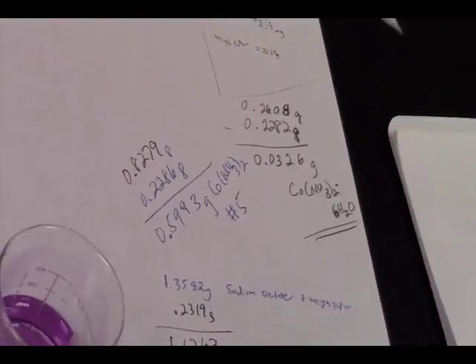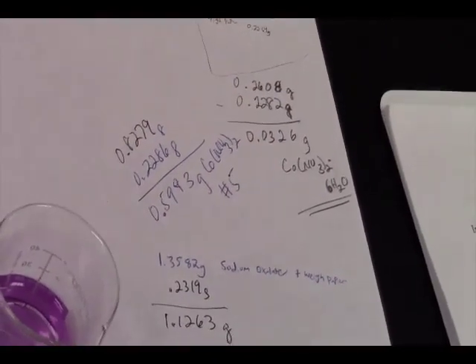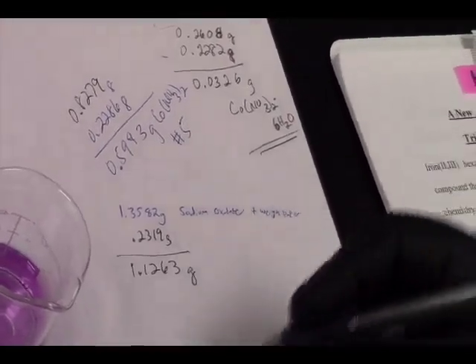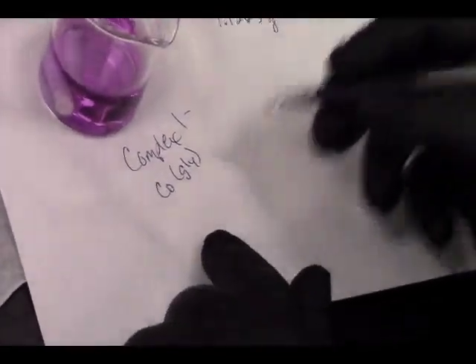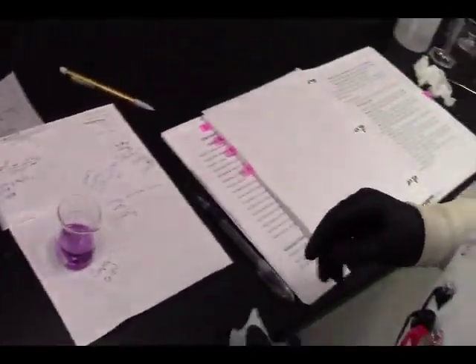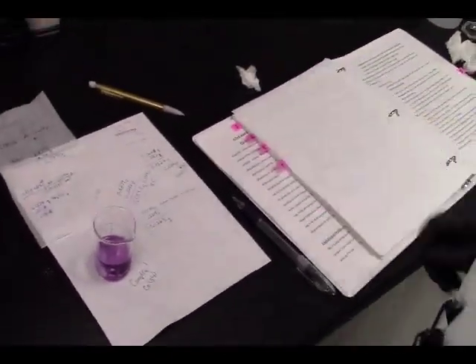All right, do I have my grams for everything else that I need on here? This is sodium oxalate. This is the glycine. All right. Got to keep all this together, as you well know. And I will put it in a notebook.